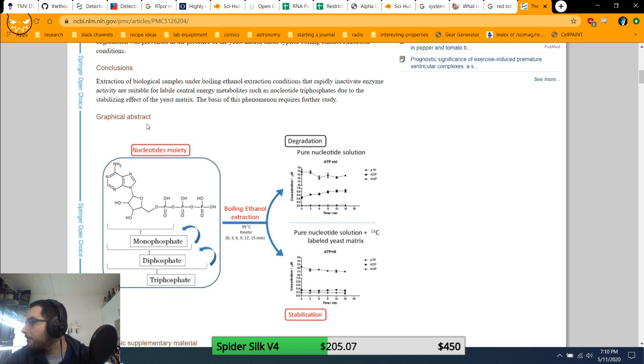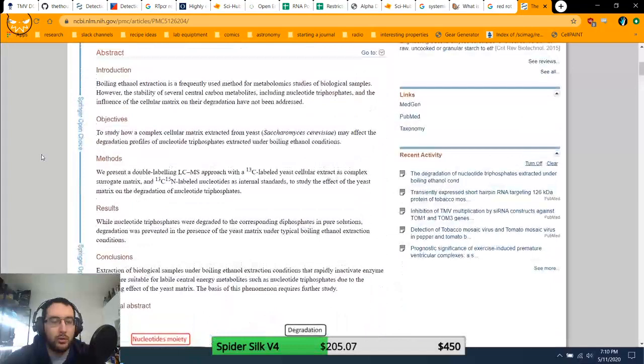Okay, well, that throws a wrench into my RNA plan, but that's fine. Anything I pop open should have NTPs in it. So I should be able to just lyse open a bunch of bacteria and it should be full of NTPs, so it doesn't matter. So I'll just do a separate extract.